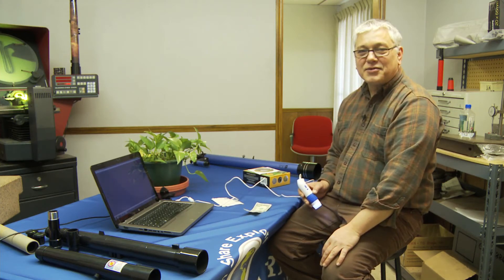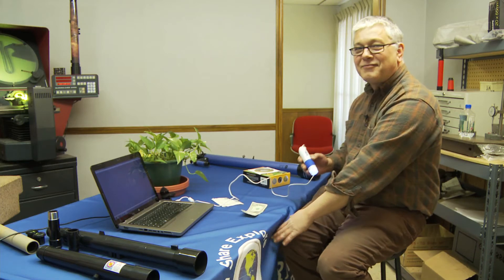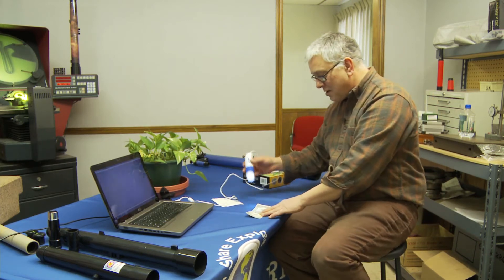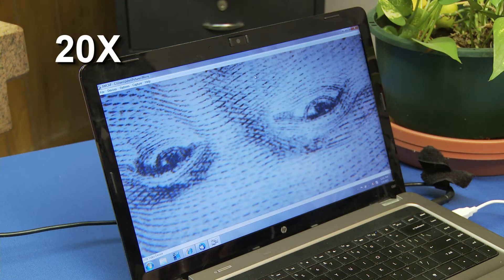So my partner John was fortunate enough to give me a dollar to work with — it'll be the last time he sees that. But I'm going to put this down here and I'm going to focus on the dollar. And you can see that's what we're looking at at 20 times.